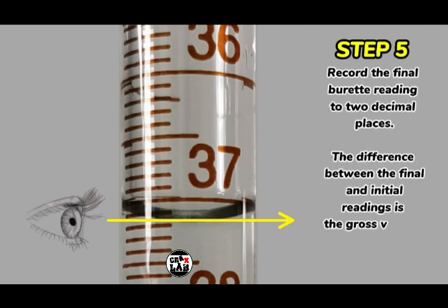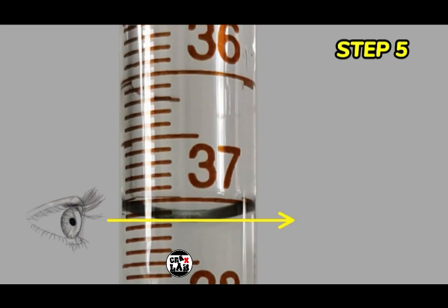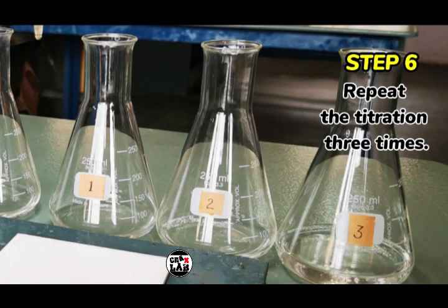Step 5. Record the final burette reading to 2 decimal places. The difference between the final and initial readings is the gross volume. Step 6. Repeat the titration 3 times.